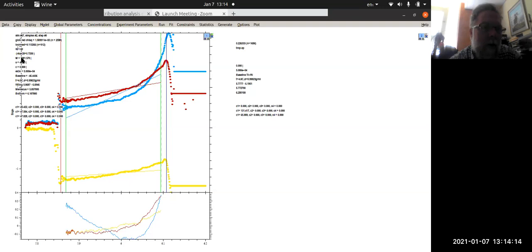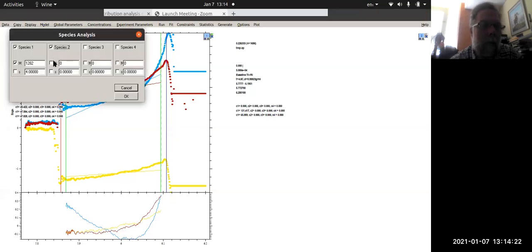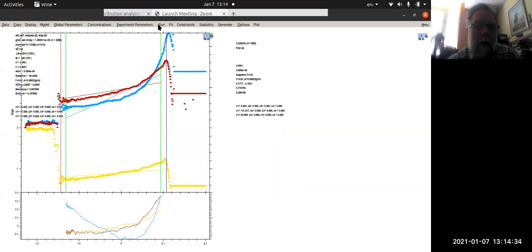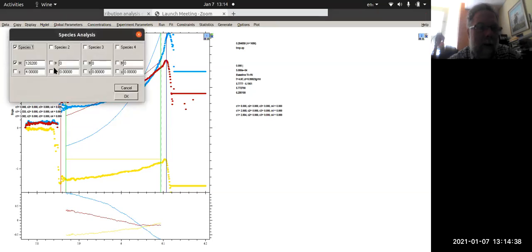And so I've asked it now to adjust the molecular weight, and it's giving me crazy values. It says it's a kilodalton. So that's garbage, of course. And one way of saying that is that maybe it's just not fitting right. I really think that what I should be doing, instead of adding another species, is adding a couple other zeros here and trying to get this to fit to something that's more like 100,000 daltons. That's actually a little too high of a guess.